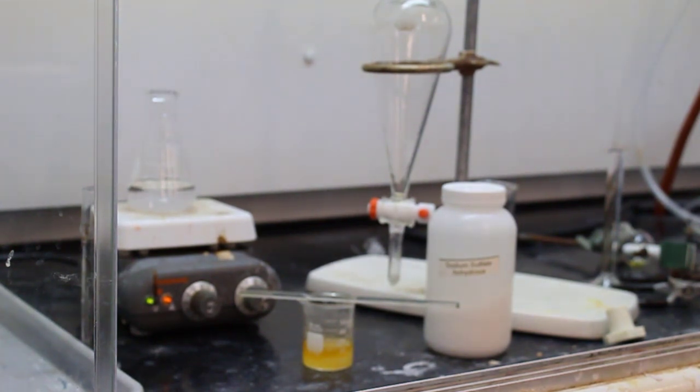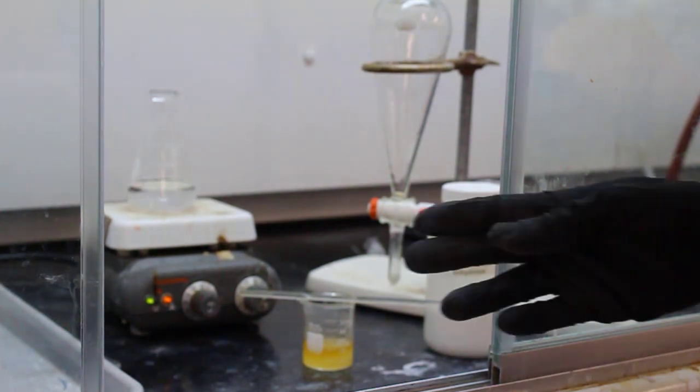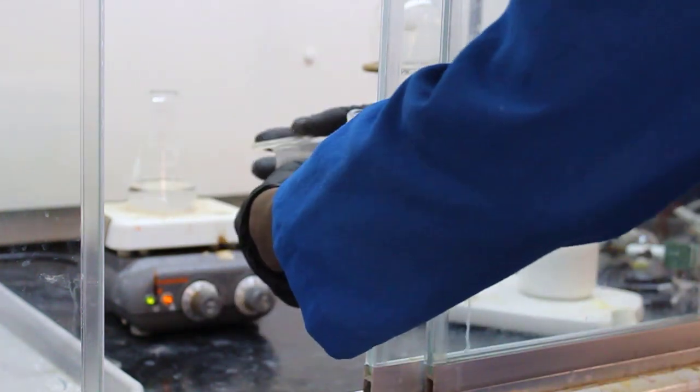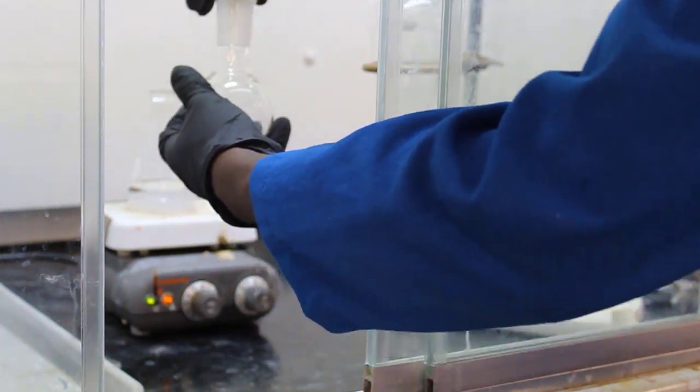Once the sodium sulfate has settled to the bottom, they're going to decant the organic layer — which contains the product — and transfer it to a rotovap round bottom flask. There's the round bottom flask; they decant it in and move on to the rotovap portion.